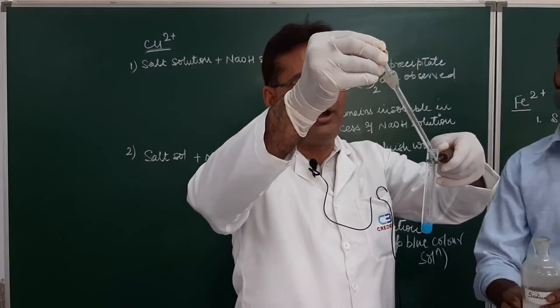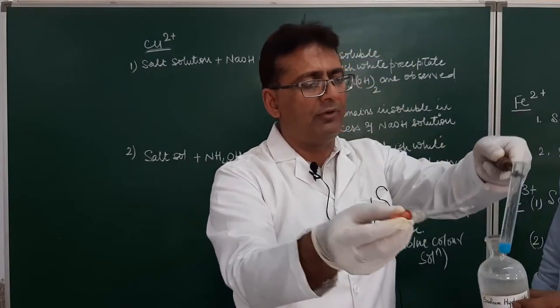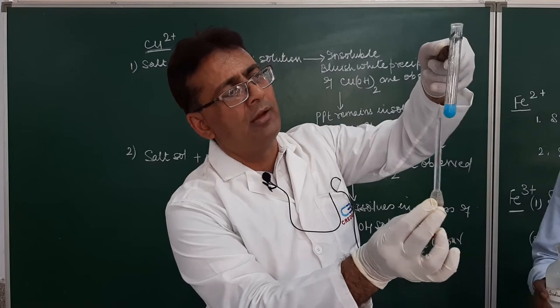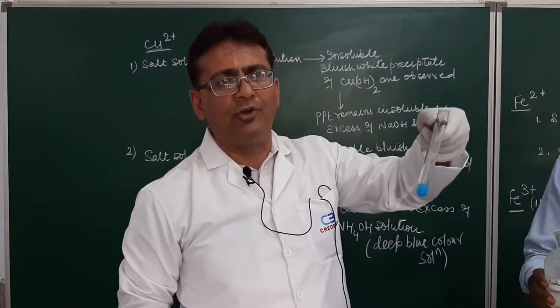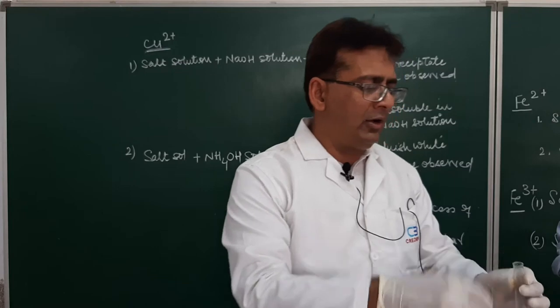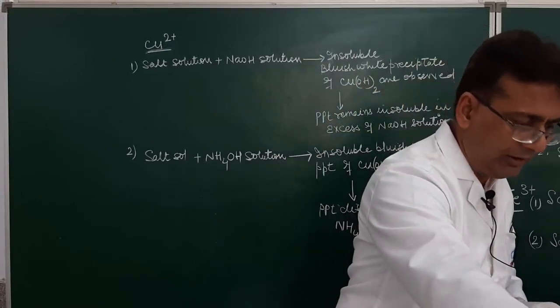Now I dissolve this in excess of sodium hydroxide solution. What do you observe? The precipitate still remains insoluble. Just observe over here, the bluish white precipitates are insoluble in excess of sodium hydroxide solution. So I think the observation in sodium hydroxide must be very, very clear.